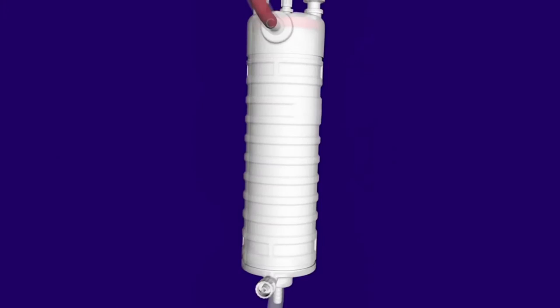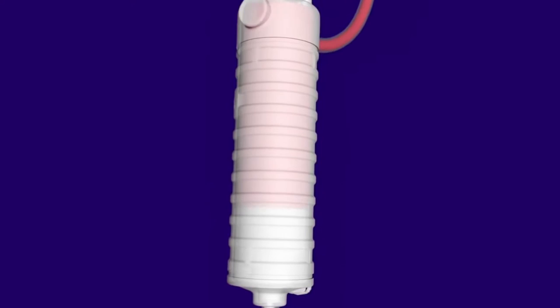This is called the filter hold-up volume. The hold-up volume results in significant economic loss if the valuable therapeutic fluids are not recovered from the filter capsule.